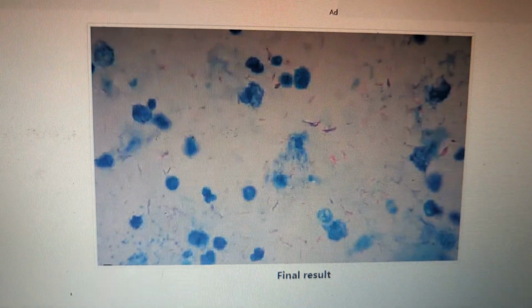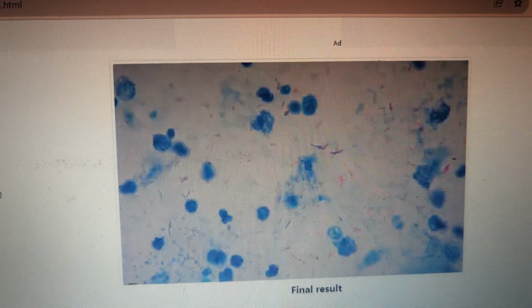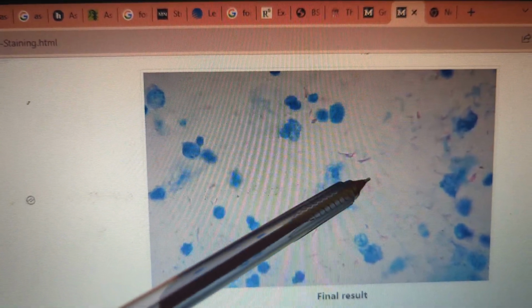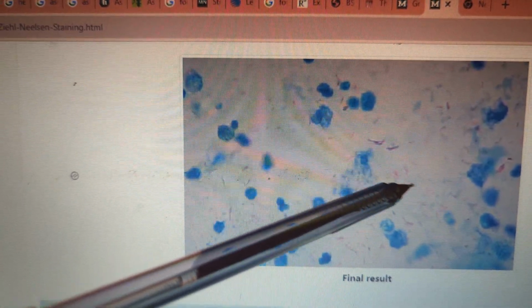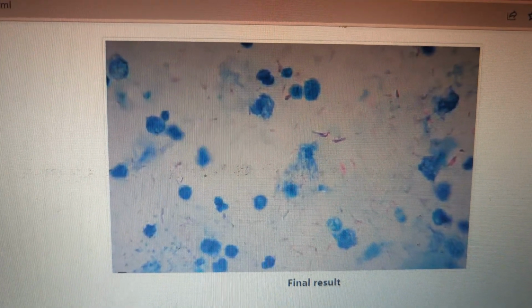And this is a microscopic view of how a Ziehl-Neelsen slide would look. It's not very clear here, but you can see a nice purple, or blue purple, you could say. Then we have some pink here. Not very clear though. So this would be a mixed slide.